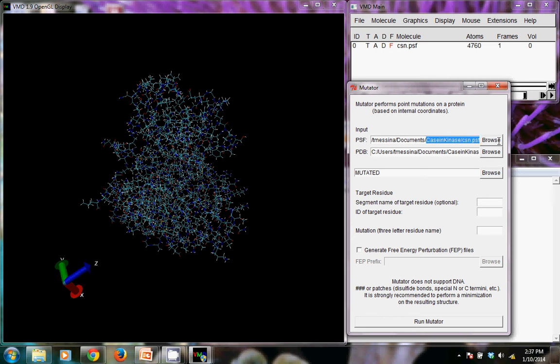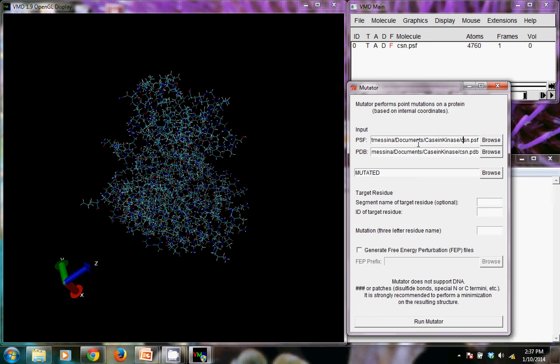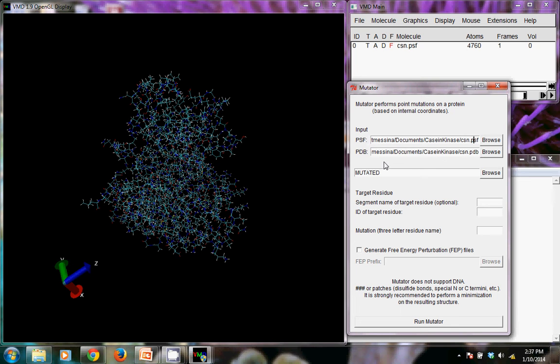And if you only have this one structure open, it does a good job of guessing which one you want to work with. So it is guessing that the input file protein structure file is the CSN.PSF and the PDB is CSN.PDB. It does require both of these inputs. So it's important that we created that PSF in the last step of this tutorial.